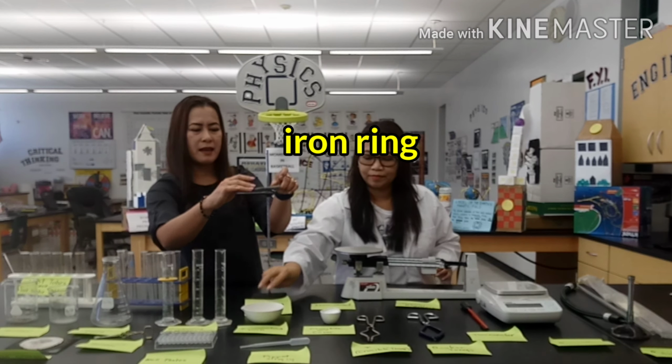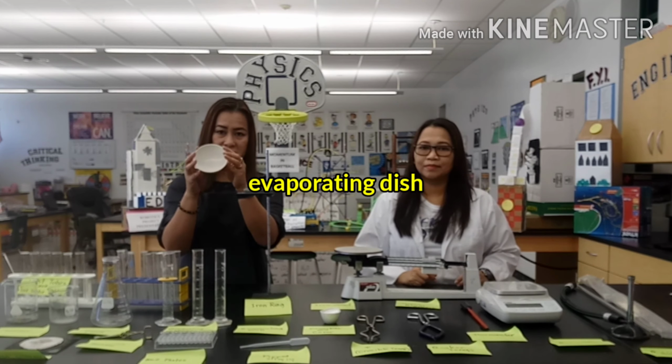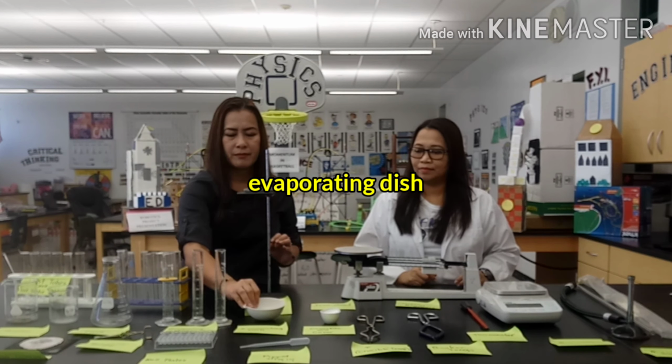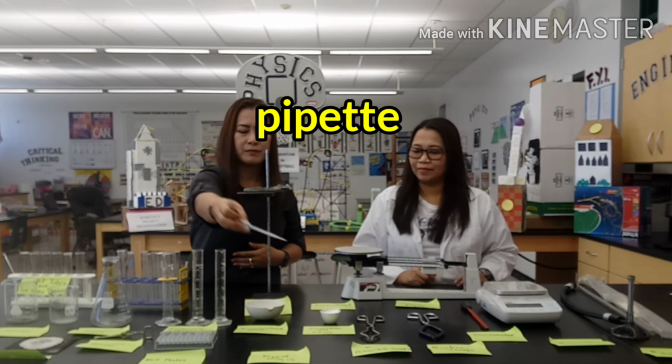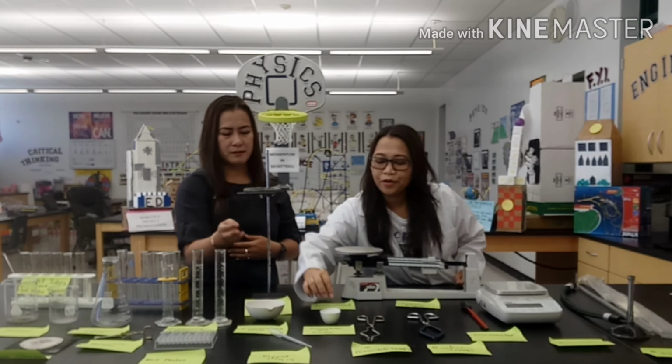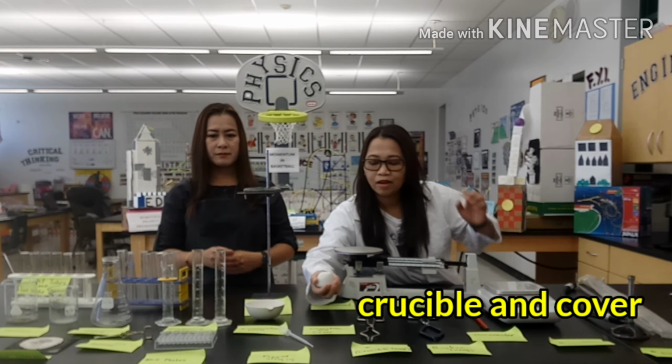So this is the iron ring, and this is the iron stand. We have the evaporating dish. We also have here the pipette. And then in here we have the crucible and cover. Right, this is the crucible and cover.